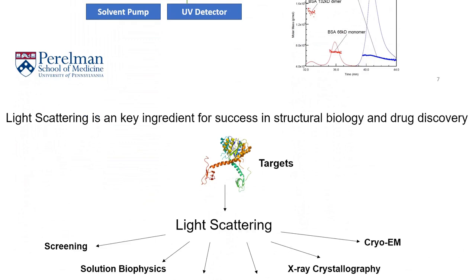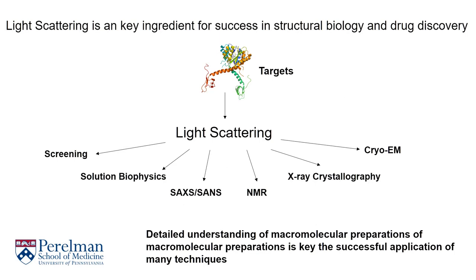For any structural biologist, biochemist, or biophysicist, light scattering and its various implementations, like dynamic light scattering and SEC-MALS, has become a day-to-day prerequisite for success in the study of biological macromolecules.